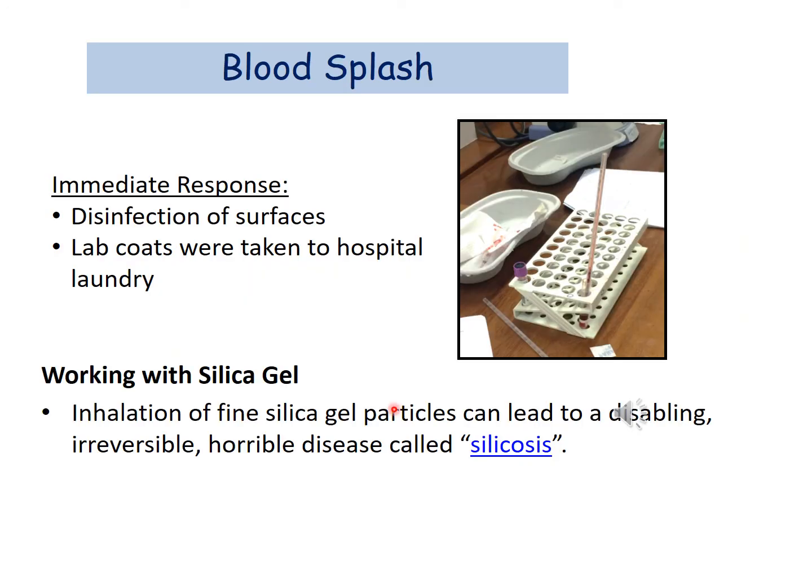And also in the hospital, sometimes people are taking samples of blood. Splashes can also happen. This is because it contains biological hazards, because each blood, depending on the patient, might have some infection, viral or fungal or bacterial, whatever, right? So we always deal with blood as a contaminated source. Okay, so if there is a minor blood splash onto your working area or into the equipment or the desk, disinfect the surface area.